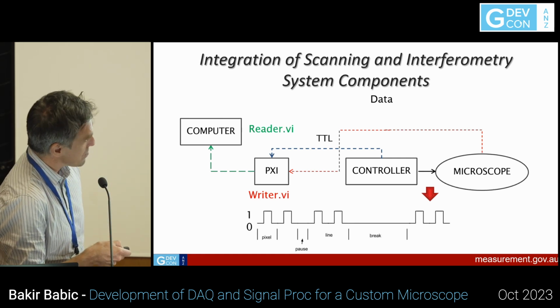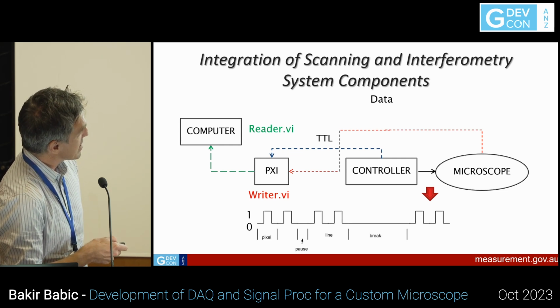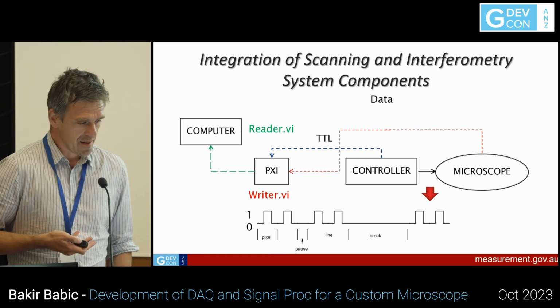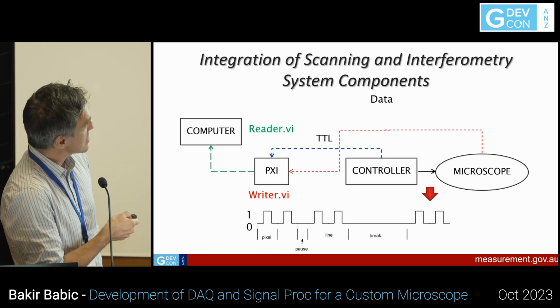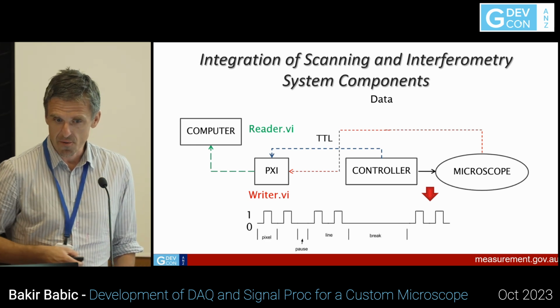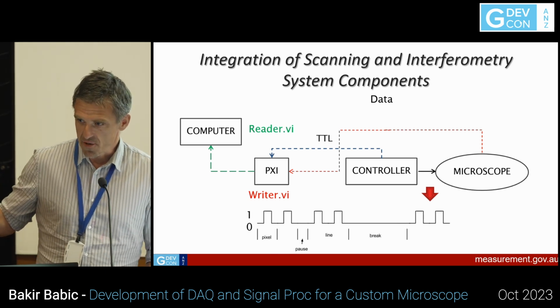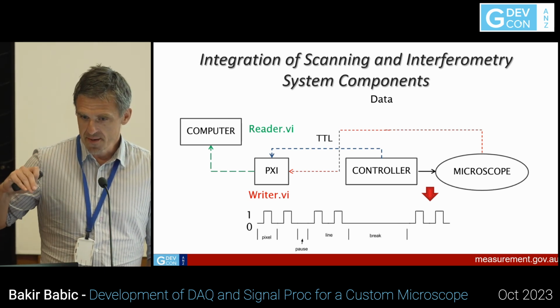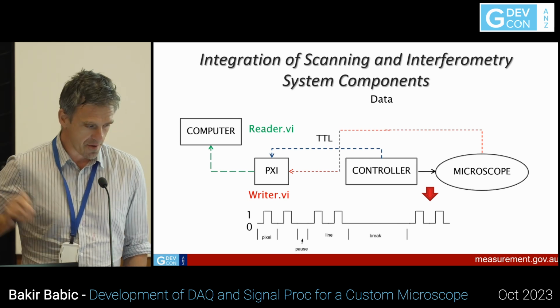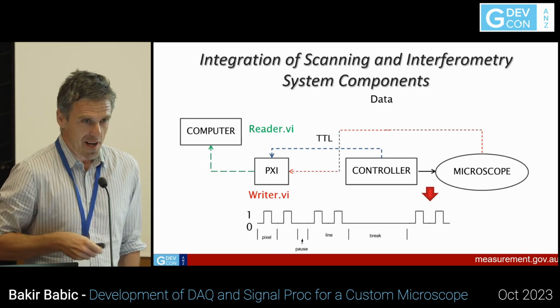So I'll just mention that there's another issue. What I told you about is the microscope, and you have a bunch of other signals coming from the microscope. So you have to sync them, and the way we do it is through a TTL signal between the controllers. So we can do the data acquisition, capturing all these signal channels which are related, let's say, to environmental control, and then we get this point cloud. We can then plot whatever we would like and visualize later on. So we don't do that in real time yet.